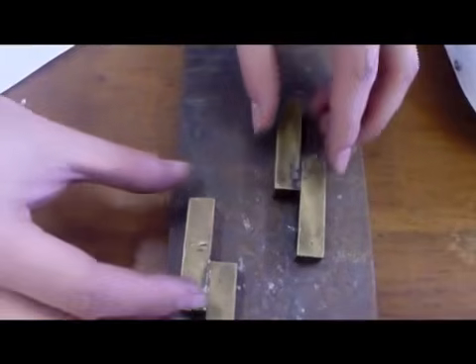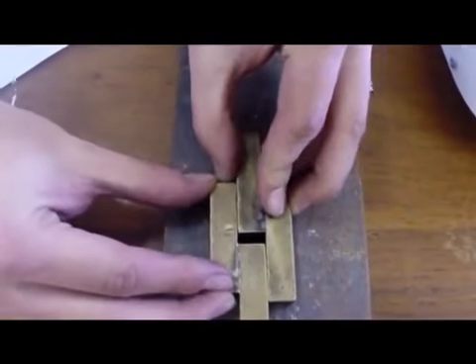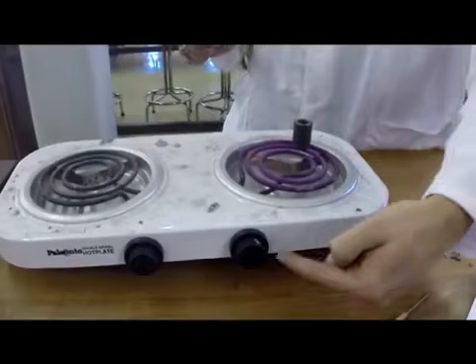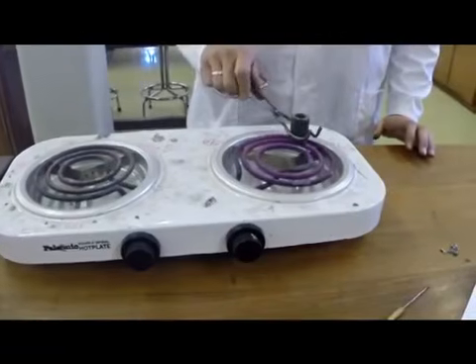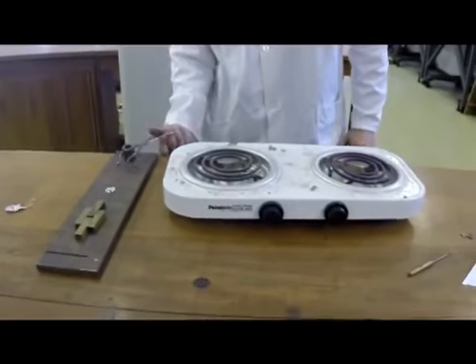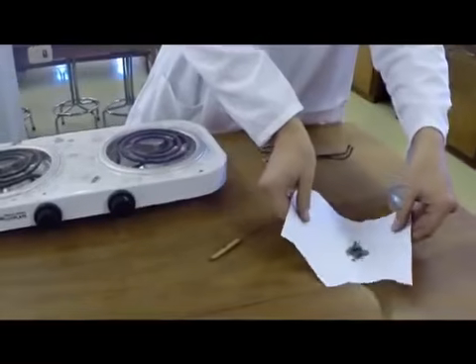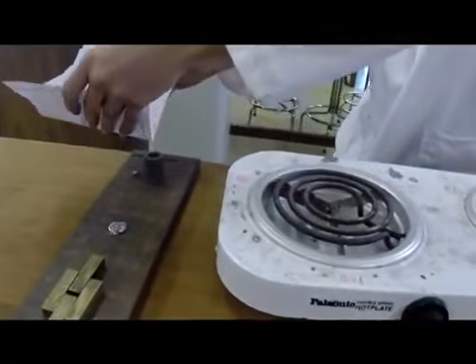Place 2 casting molds next to one another, ensuring that you leave a 5 mm gap into which the molten metal will be poured. Turn on the heating coil and preheat the crucible before firmly tapping it on the metal plate provided, in order to remove impurities that may have built up in it. Now place each combination of lead and tin into a separate crucible and quickly place the crucible back on the heating coil.